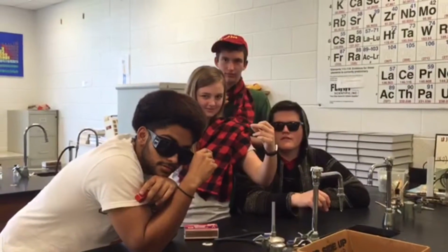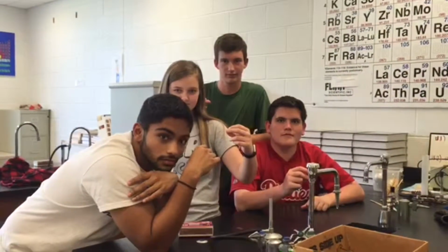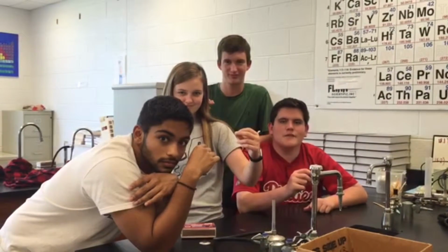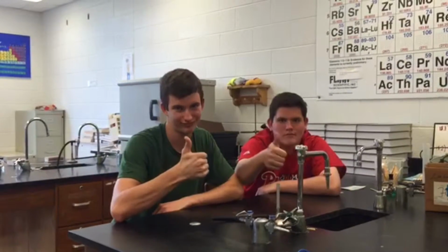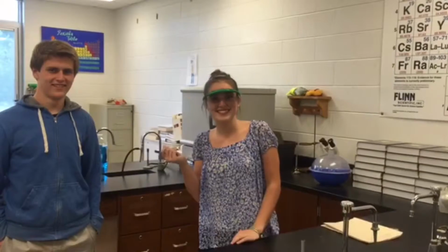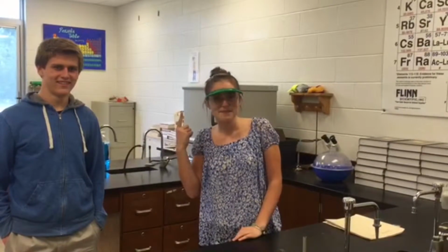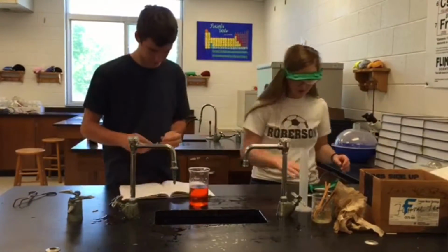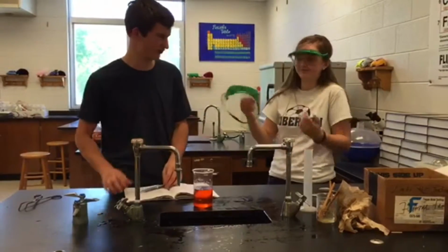Don't wear this. Dress more like this. Wear appropriate clothing at all times during a lab. Quit the tomfoolery. Lose your jewelry. Don't be whack. Tie your hair back. If you want to be wise, wear goggles to protect your eyes.